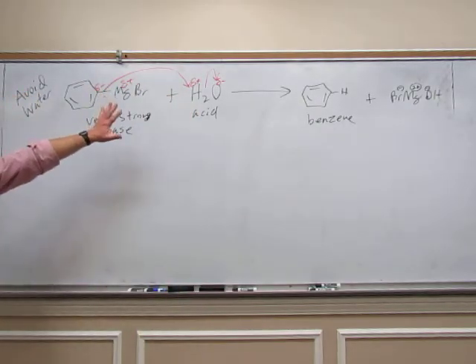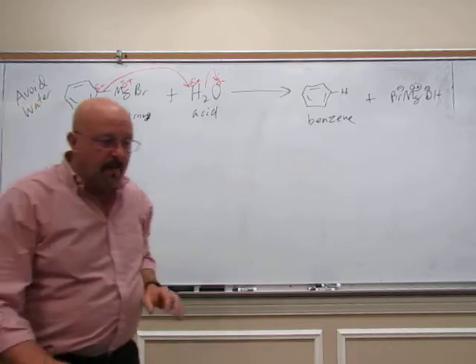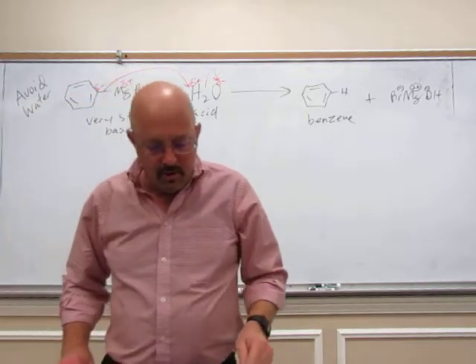We have a magnesium salt as a byproduct, but we've just made benzene — we've destroyed the Grignard. You can buy benzene; it's a common solvent, there's no reason to make it. You've just wasted your Grignard, so you need to make certain that everything remains dry.